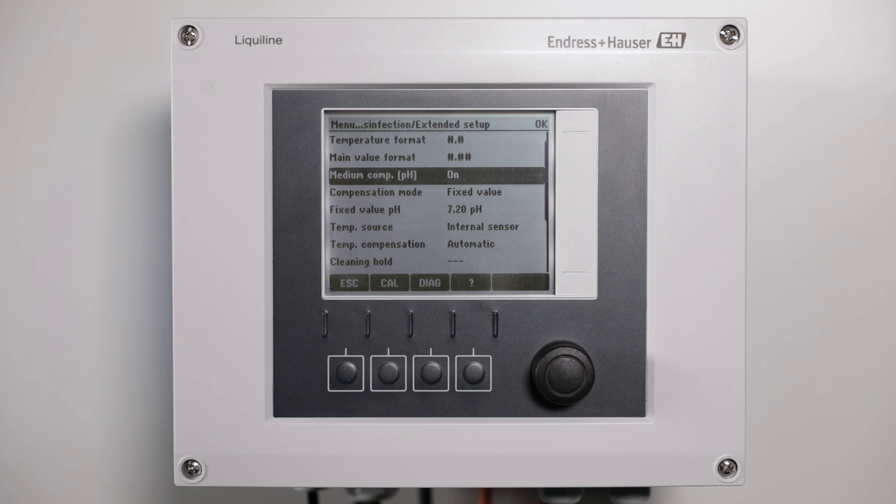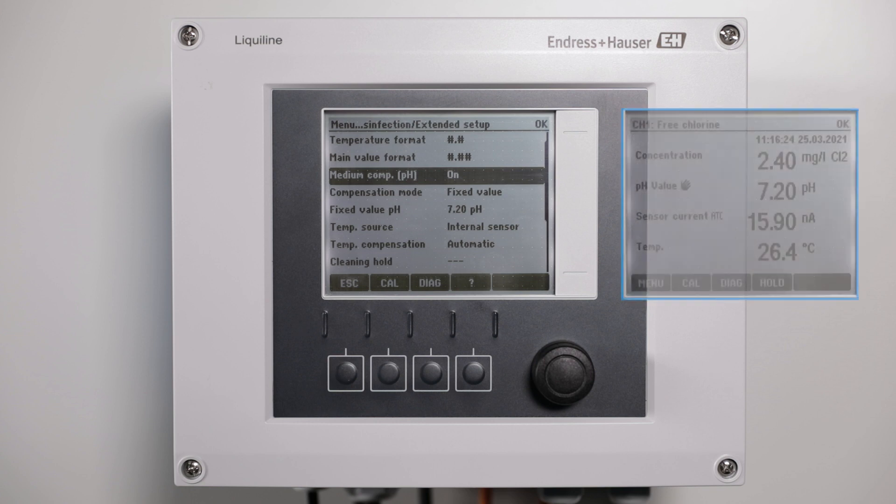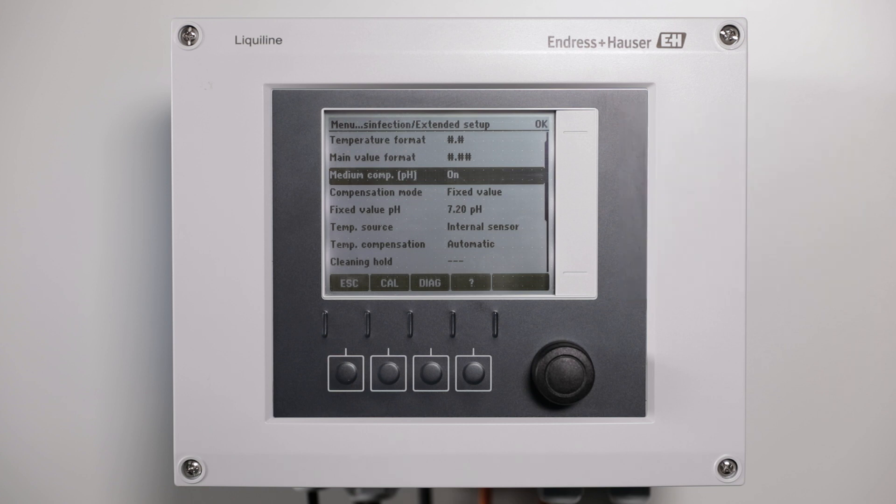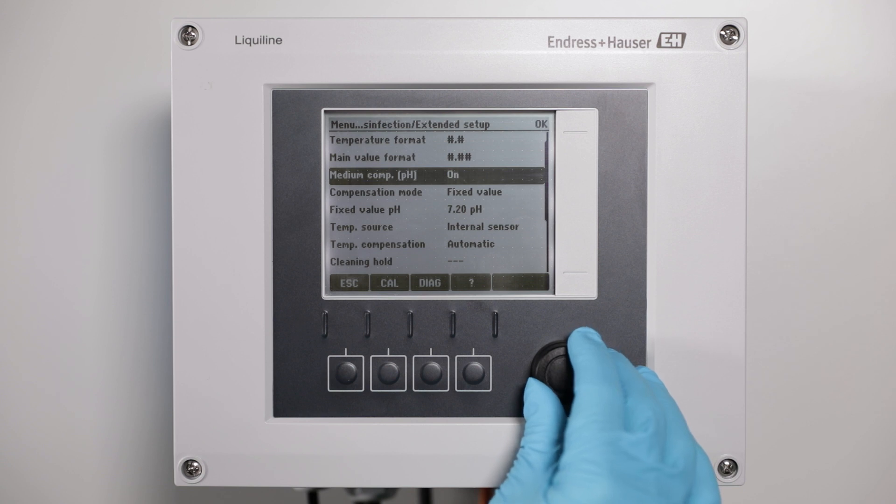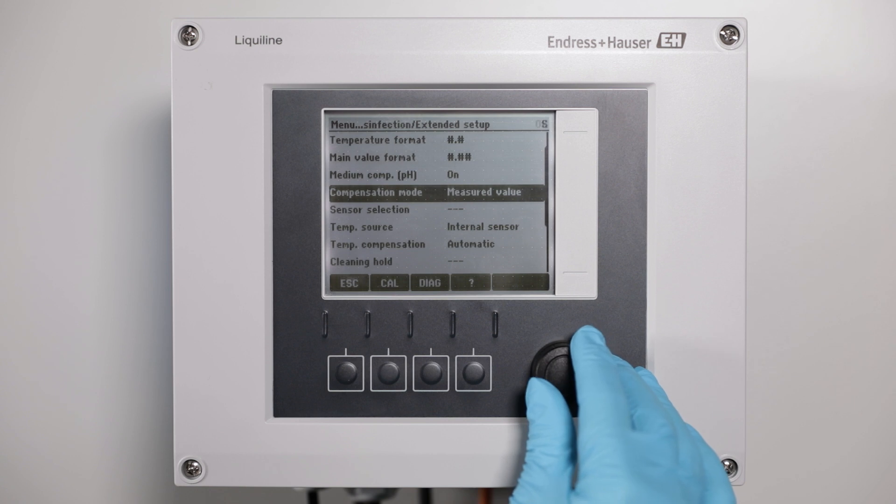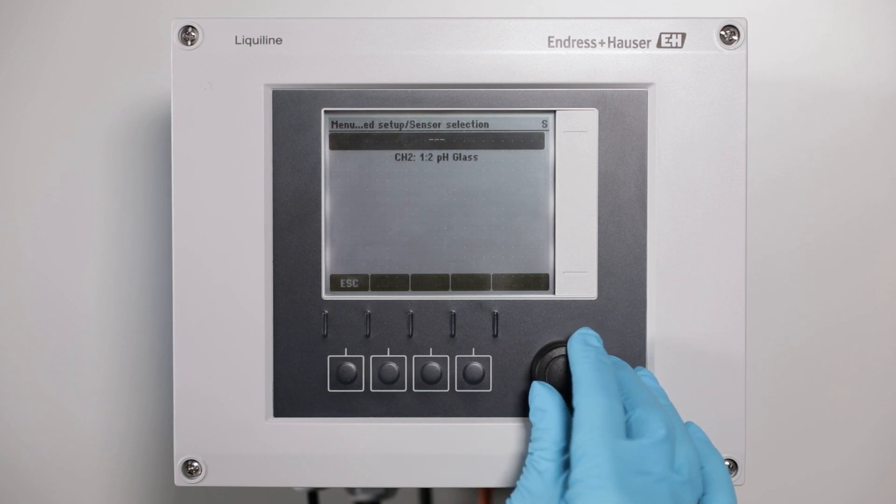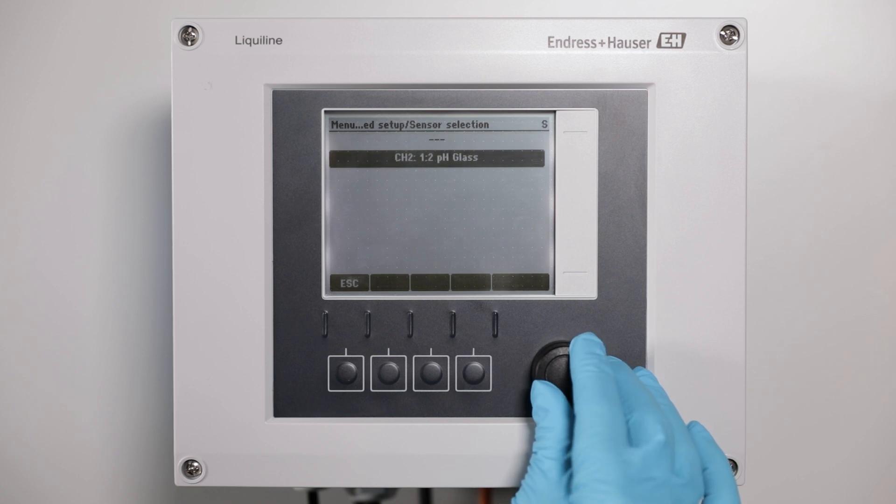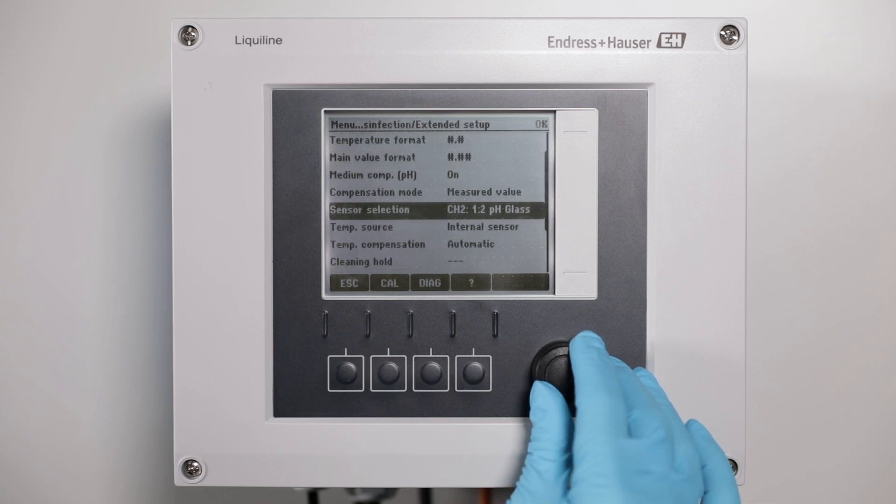Per default the pH compensation is on and related to the fixed value of pH 7.2. This is shown by the hand symbol on the measurement screen. To use the value of the installed pH sensor for compensation, go to Compensation mode and select Measured Value. Scroll down to the sensor selection and assign the respective pH sensor from the sensor selection.